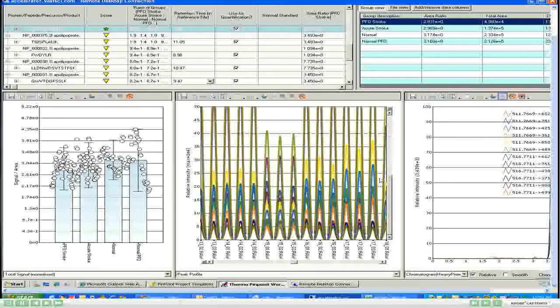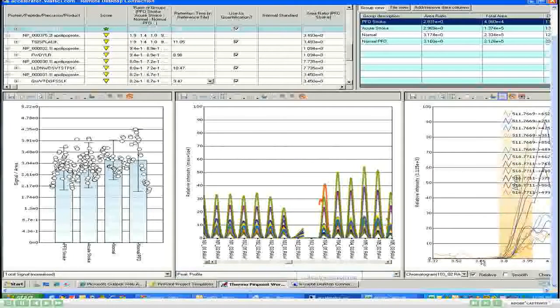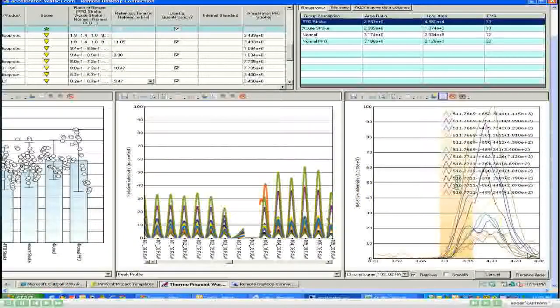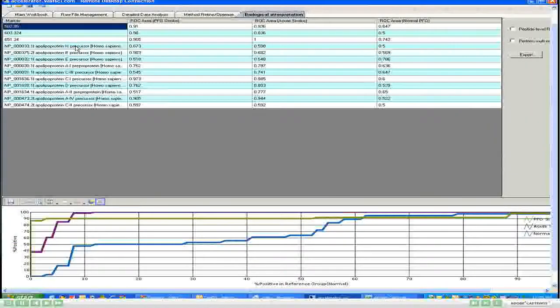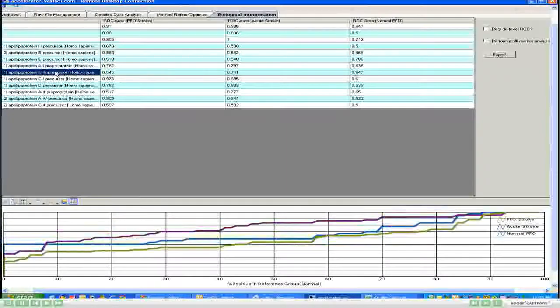Go to data analysis. So we are looking for a particular peptide right now, and this graph has lots and lots of colors and chromatograms. The benefit of this graph is you can zoom into any region and see if there's any particular file which has been misaligned or is not correctly run. This is the best way to view about 300 files all in one single snapshot. You can look at ion ratios, peak profiles, peak shapes, CVs, every single thing in just one single view. So for example, this file has not been correctly integrated.